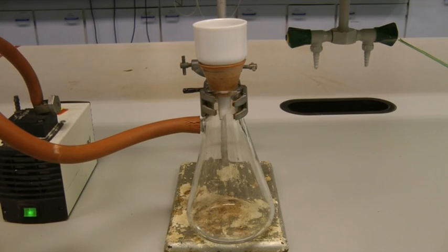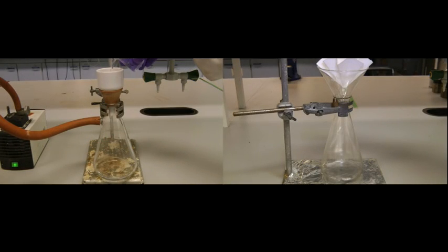Vacuum filtration is another method of separating solid and liquid from a mixture. In this case, it's commonly employed where the solid is the product you are interested in and the liquid is waste.